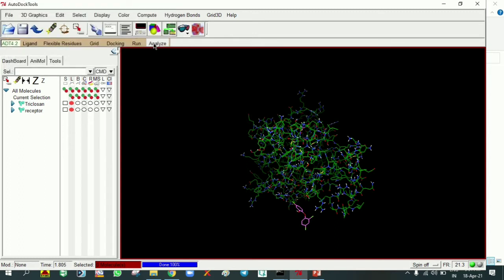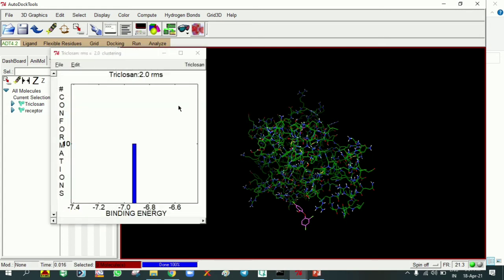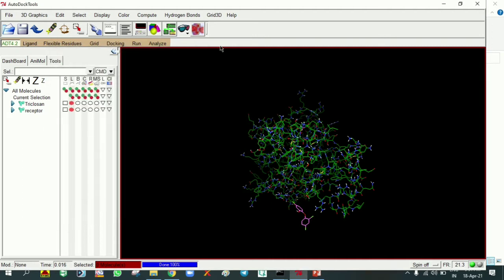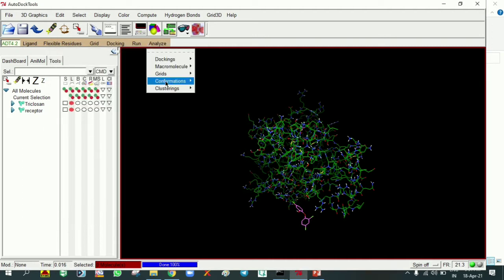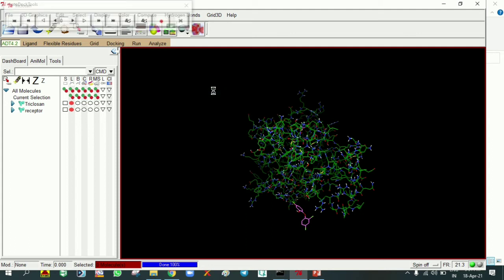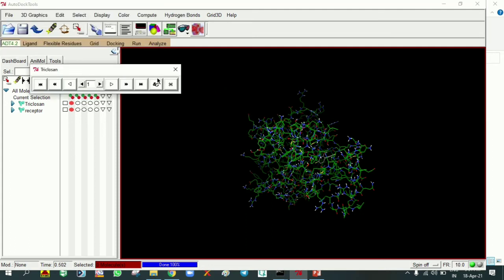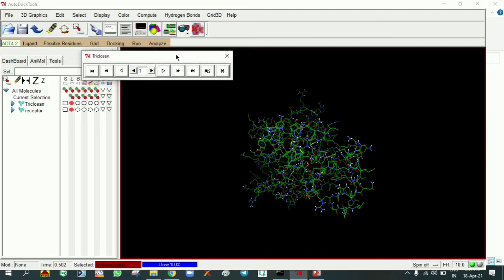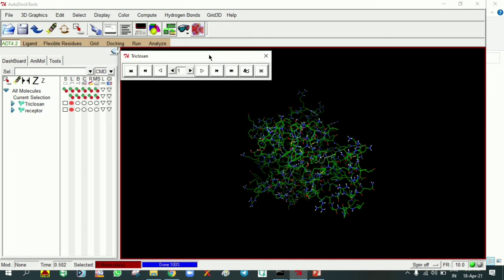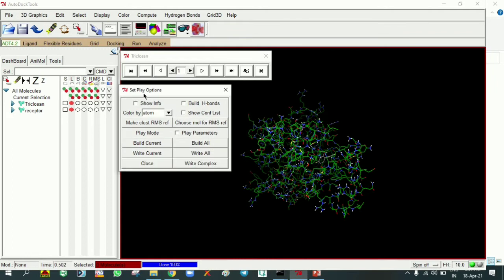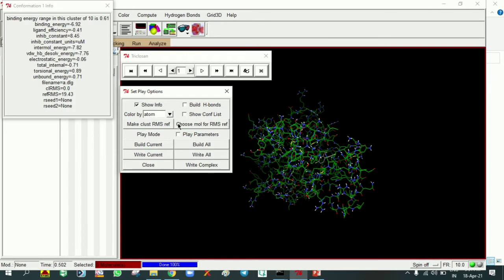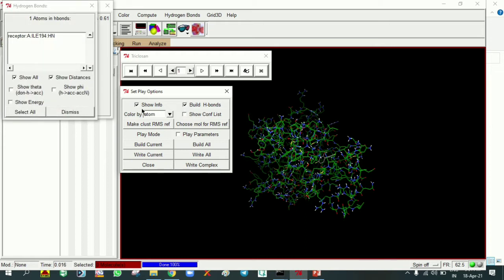Again go to Analyze, go to Clusters, Show. It will show the clusters of your compound. Close that. Then go to Analyze Again, Conformations, Play Ranked by Energy. This will give a short window. Here we can see open panels to change play options. If we click this, the set play options appear. I'm clicking show info and build hydrogen bonds, making these two active.